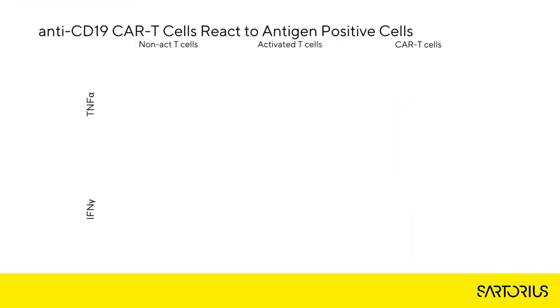We compared CAR T cells to non-activated and Dynabead-activated T cells obtained from the same donor over the course of 3 days. The CAR T cells used are 54% antigen positive, meaning 46% of cells within the CAR T wells are normal, non-transfected T cells. Effector cells were plated in the presence of CD19 positive Ramos NucLight Green cells or CD19 negative Jurkat NucLight Green cells. 10 microliter samples were taken on 3 sequential days and analysed using the T cell exhaustion kit.